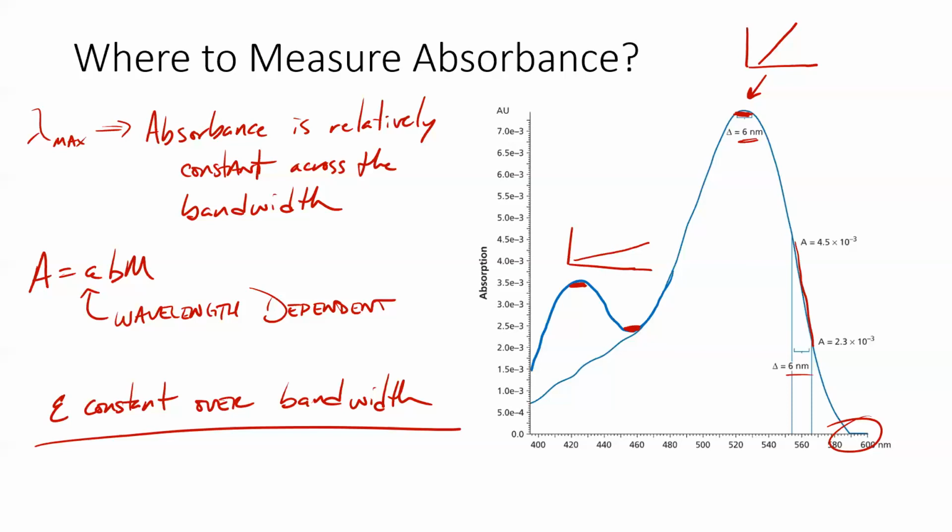But certainly there are instances where both are useful, but more often we use the absolute maximum rather than the local maximum. Any questions about that stuff?